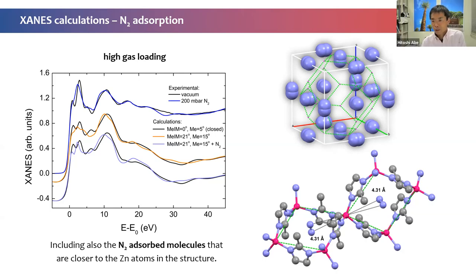Thank you. Any other questions? Well, one question I have. The beam size is something like several hundred microns at the beamline, right? Yes, 300 by 400. Are there any difficulties or struggle points to measure the high resolution spectrum? No, the beam size constrains the size of the capillary, okay? Because one of the things that you need is that if you use very, very small capillaries, you will have the beam going over the capillary, and it's not very nice, okay? So this constrains the diameter of the capillary. Okay, thank you.